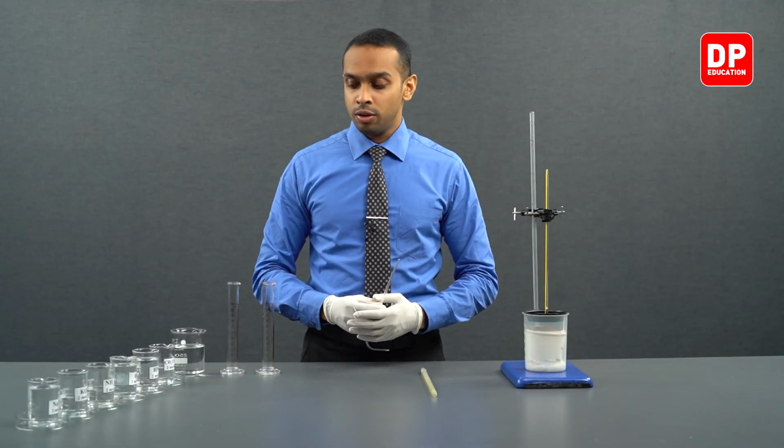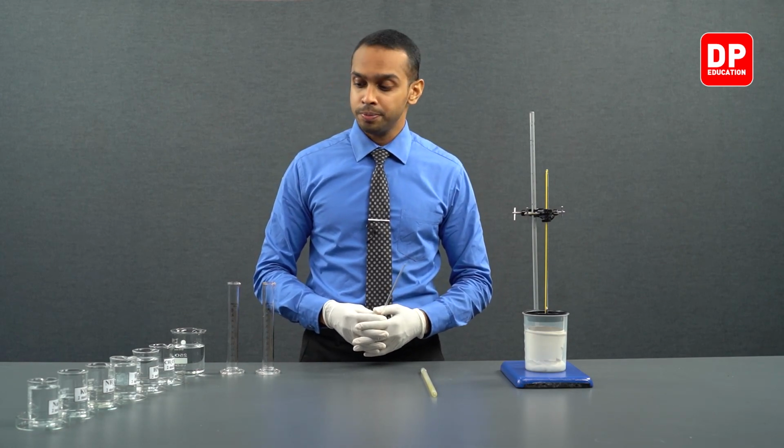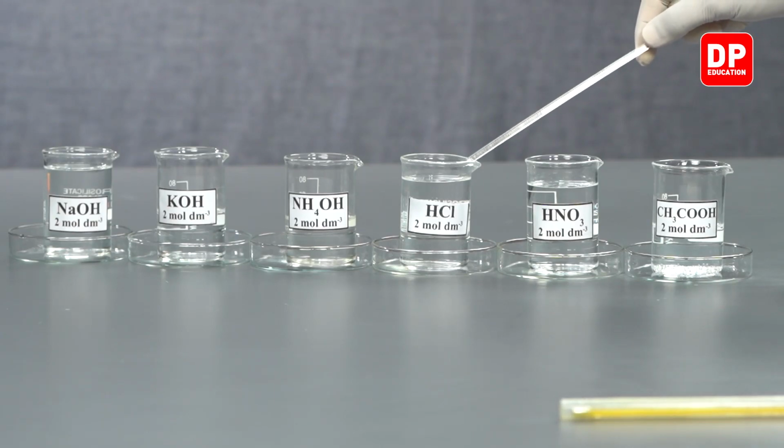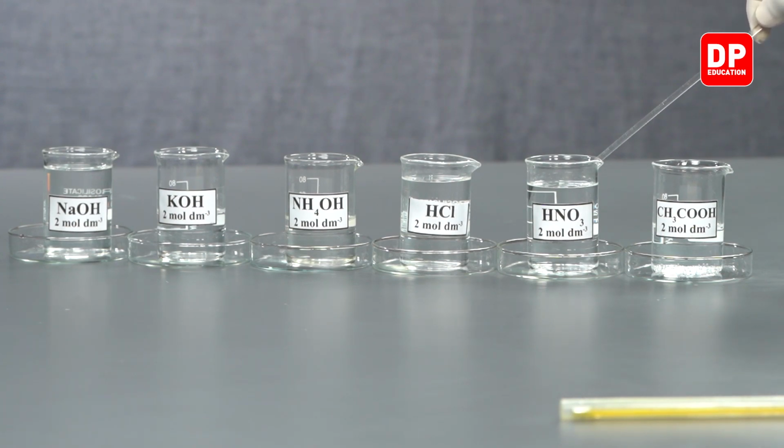And we will be using 3 different types of acids as well. We will be using HCl acid, we will be using nitric acid, and we will be using ethanoic acid.